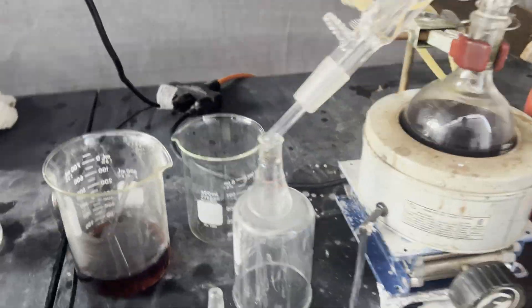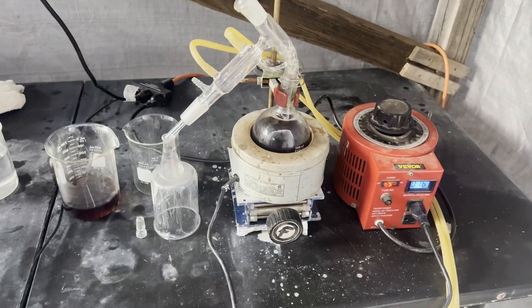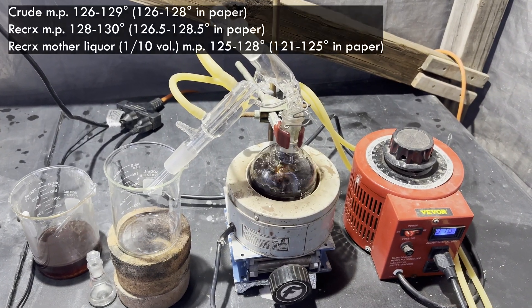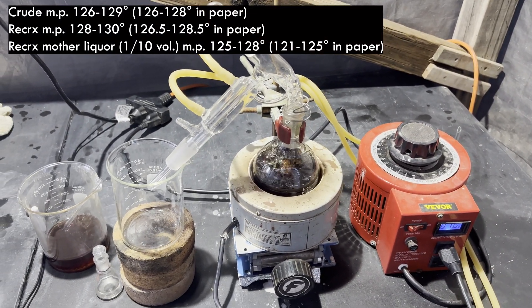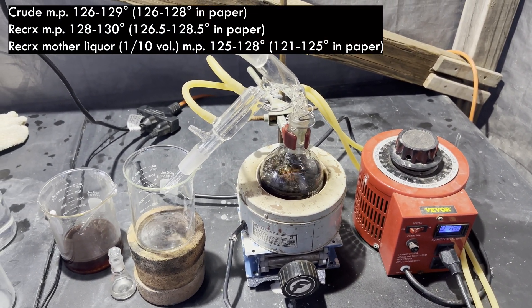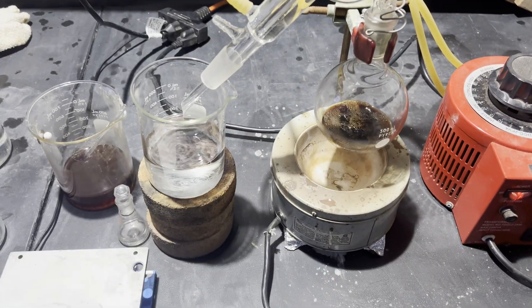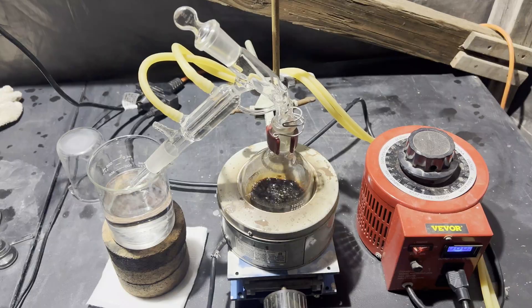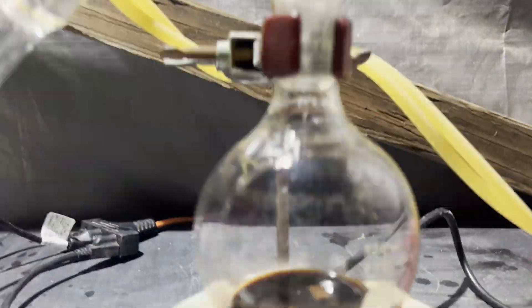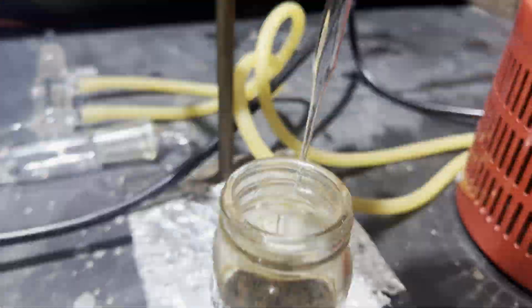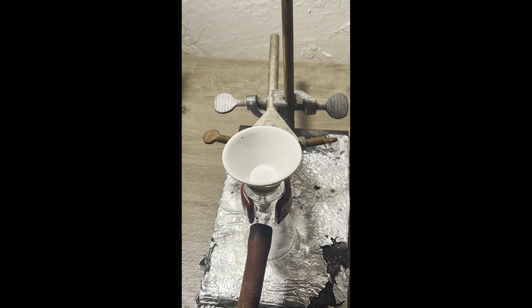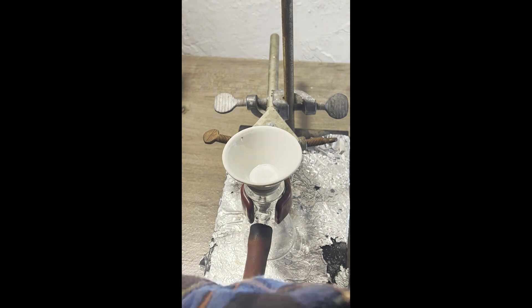I boil the filtrate down to one tenth of its volume to get a second less pure crop of crystals. Here are all the uncorrected melting points. I'm not sure why they're higher than the literature values, especially since they're supposed to be cream or cream pink colored rather than the light brown that mine are. Could be that they're uncorrected, but usually colored impurities or impurities in general lower the melting point of a sample. Oh well.